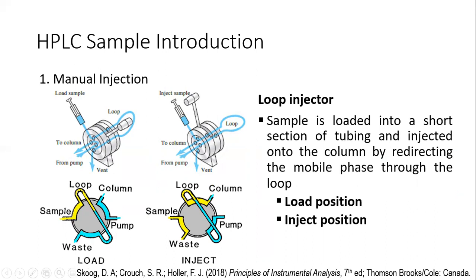If you will recall, in our introduction to the HPLC, the movement of your solvents, the mobile phase, occurs at high pressures. Okay? So mahirap na mag-inject kayo ng sample into your HPLC na merong malakas na pressure na nangyayari.